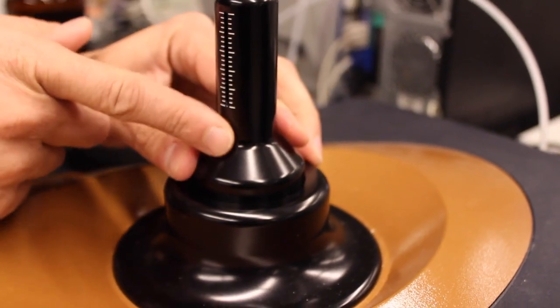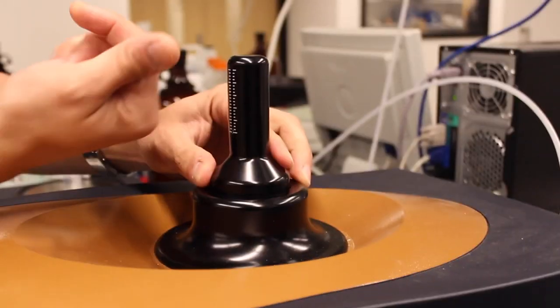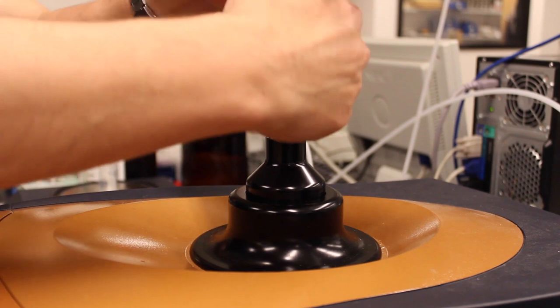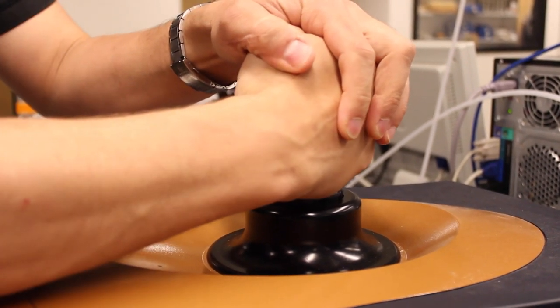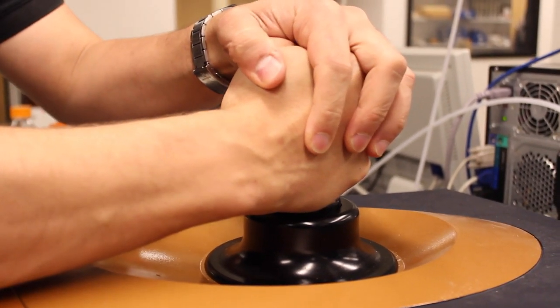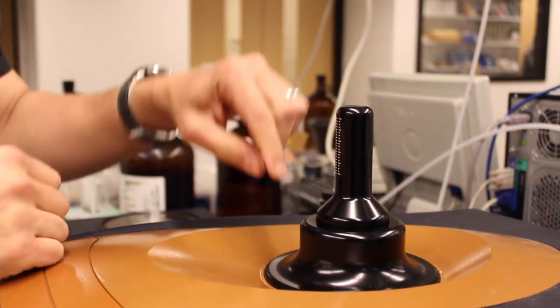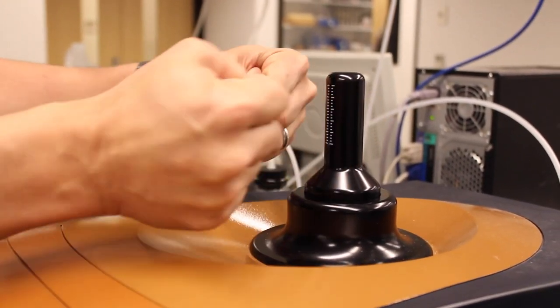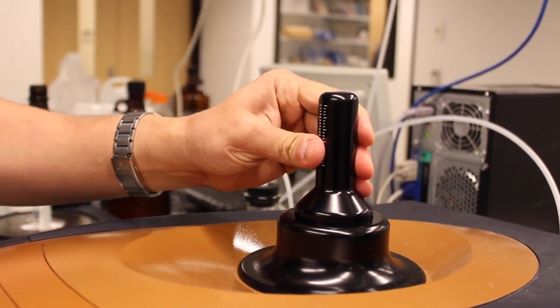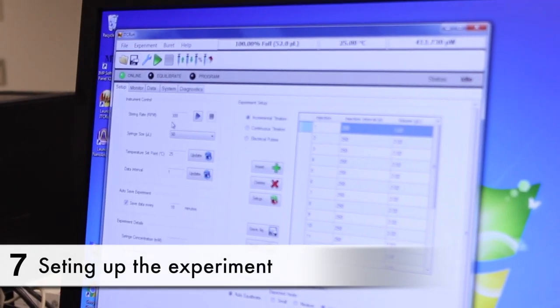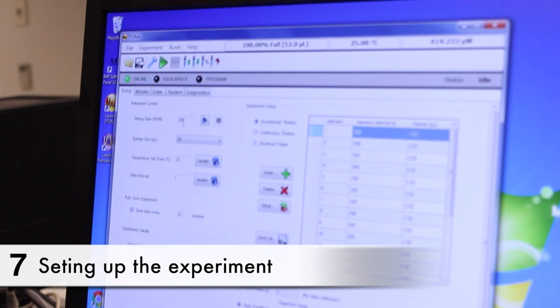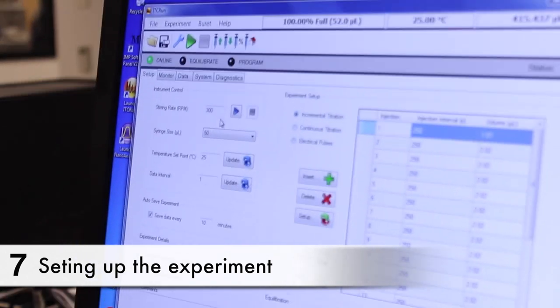Now we're inserting it back down and as before we want to rotate this until it engages the notches on the pins the marking should be toward the front of the instrument push it down with some amount of force not excessive but a significant amount of force it pushes down the springs then you turn it and it should lock in place.